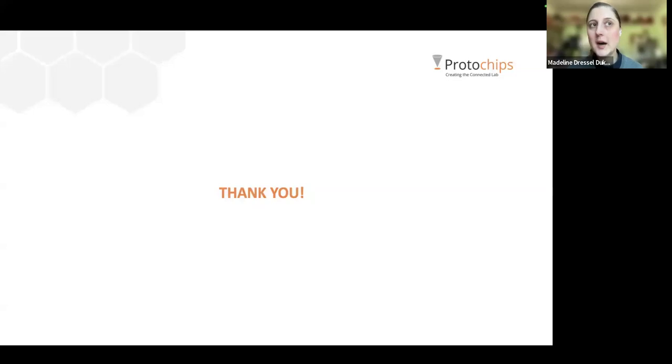People are working on that. I don't know that we have any published results. I do know several researchers who are actively pursuing that. So it's definitely something that people are really looking at. There's a nice paper that will come out hopefully soon from Catherine Granfield and Liza DiCecco at McMaster. They're looking at biomineralization on bone implants. So they actually have a FIB sample in the holder and they've got stuff flowing in there to look at that. I believe they have a communication out, but there's a full paper coming out.